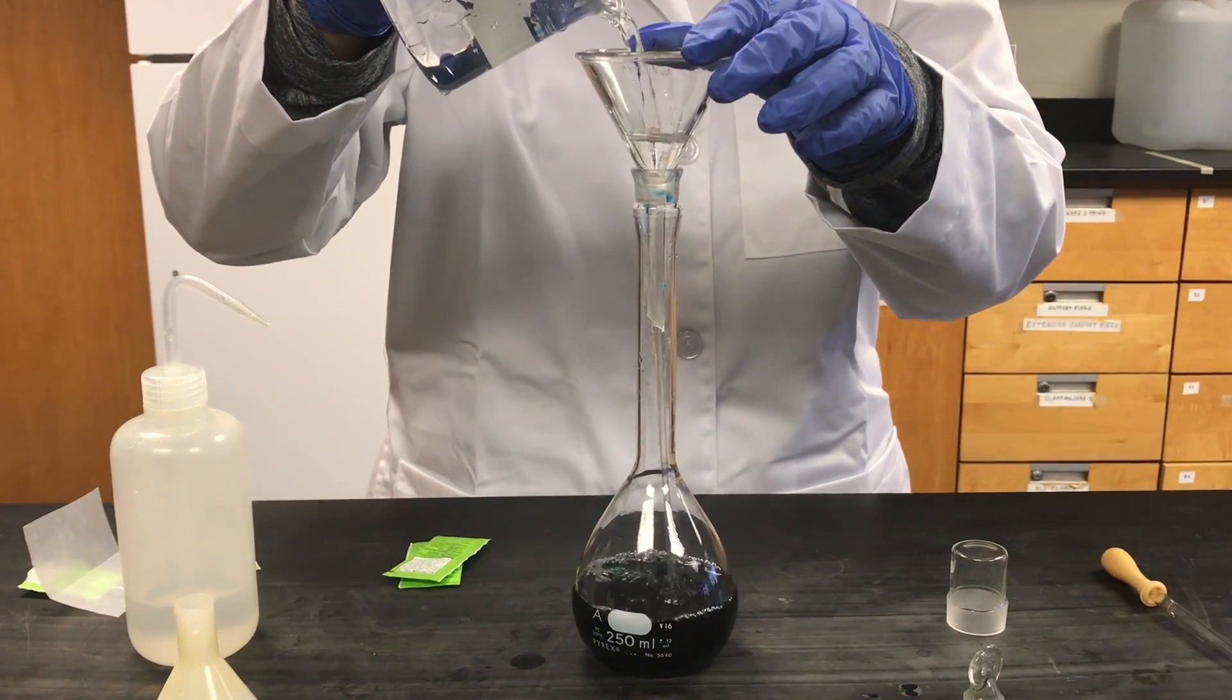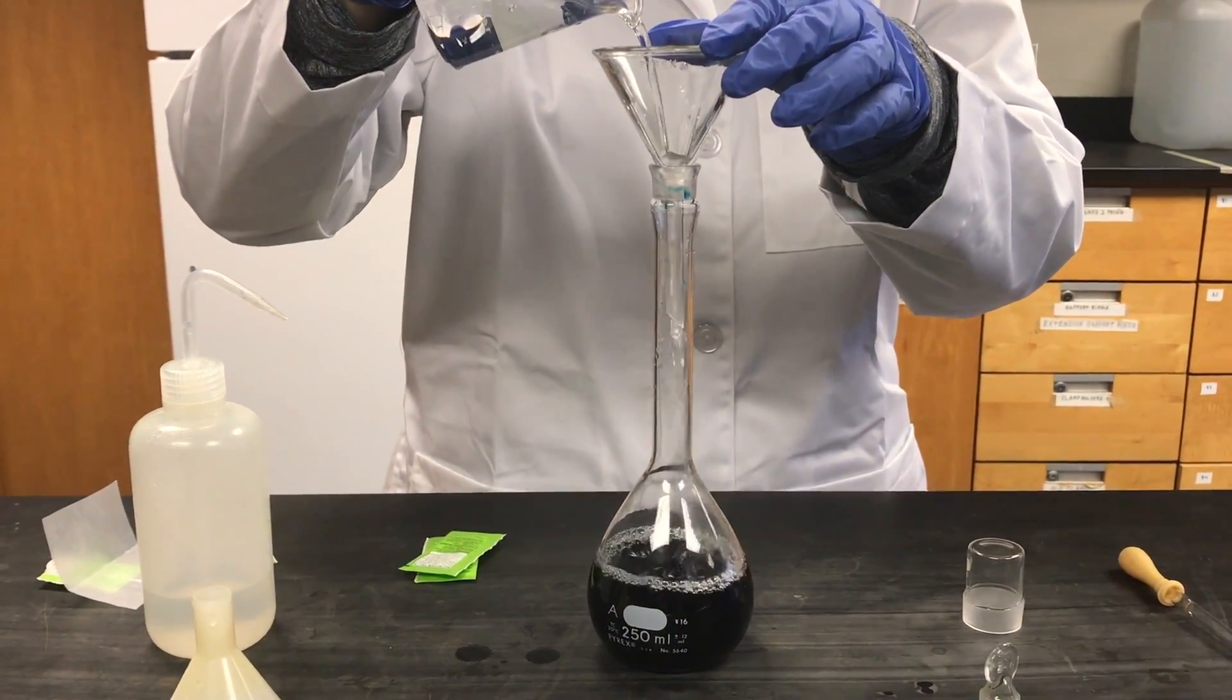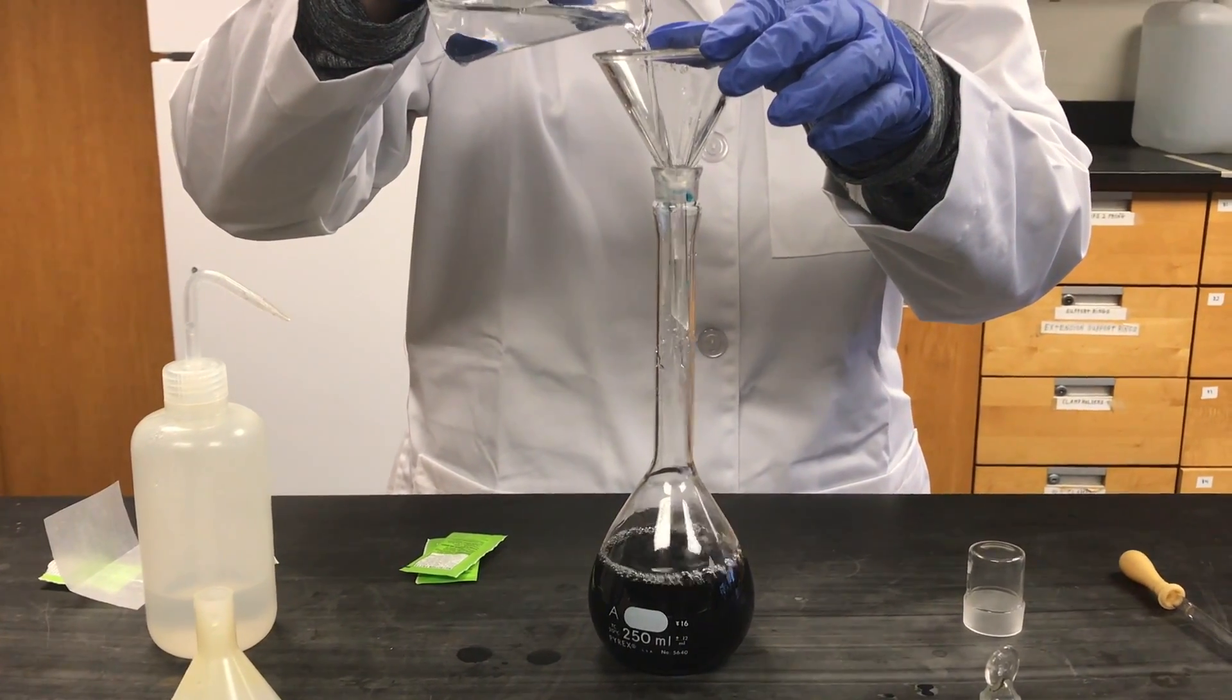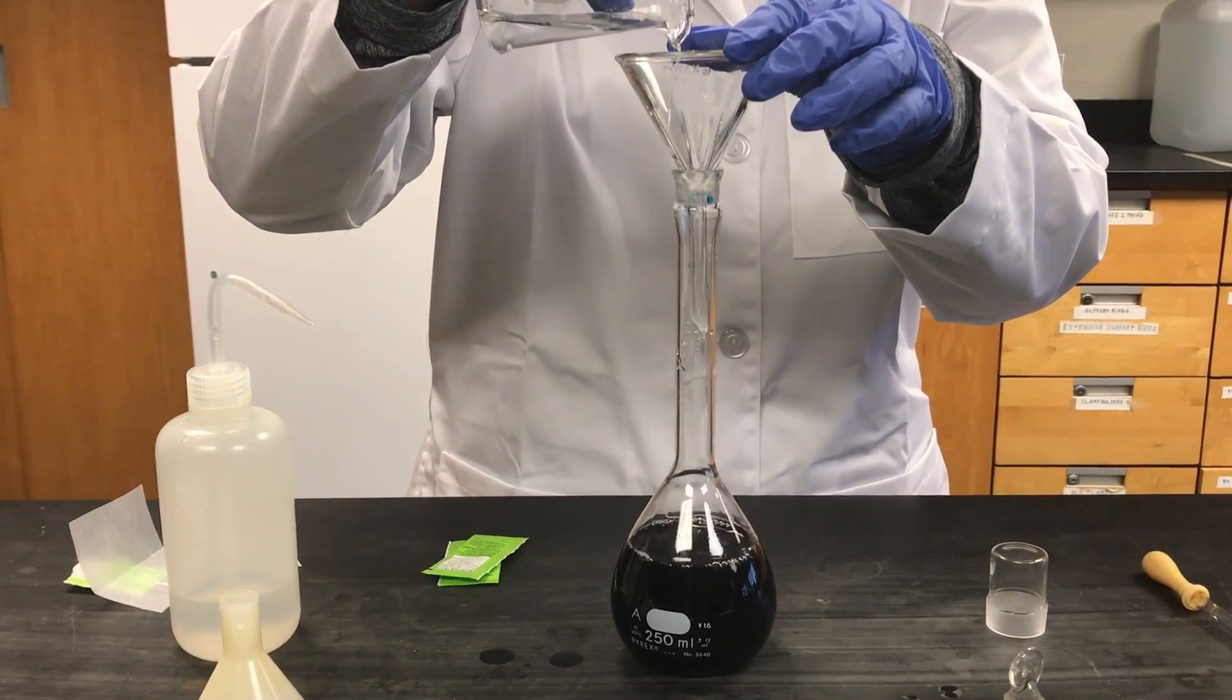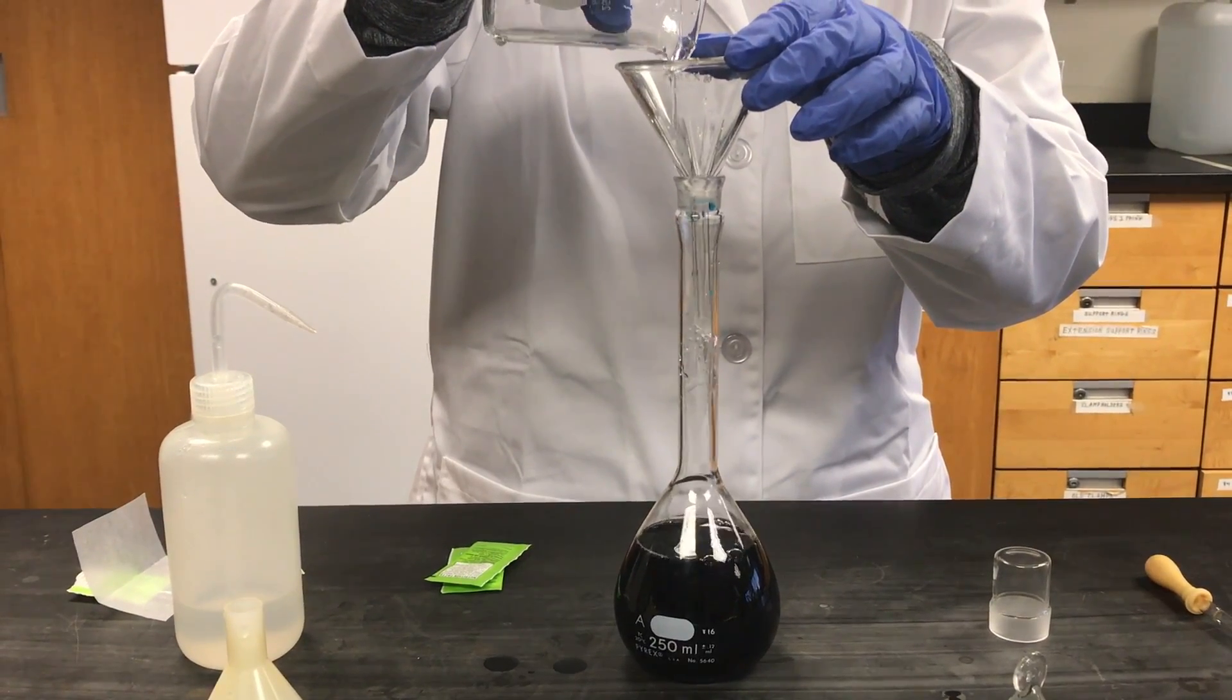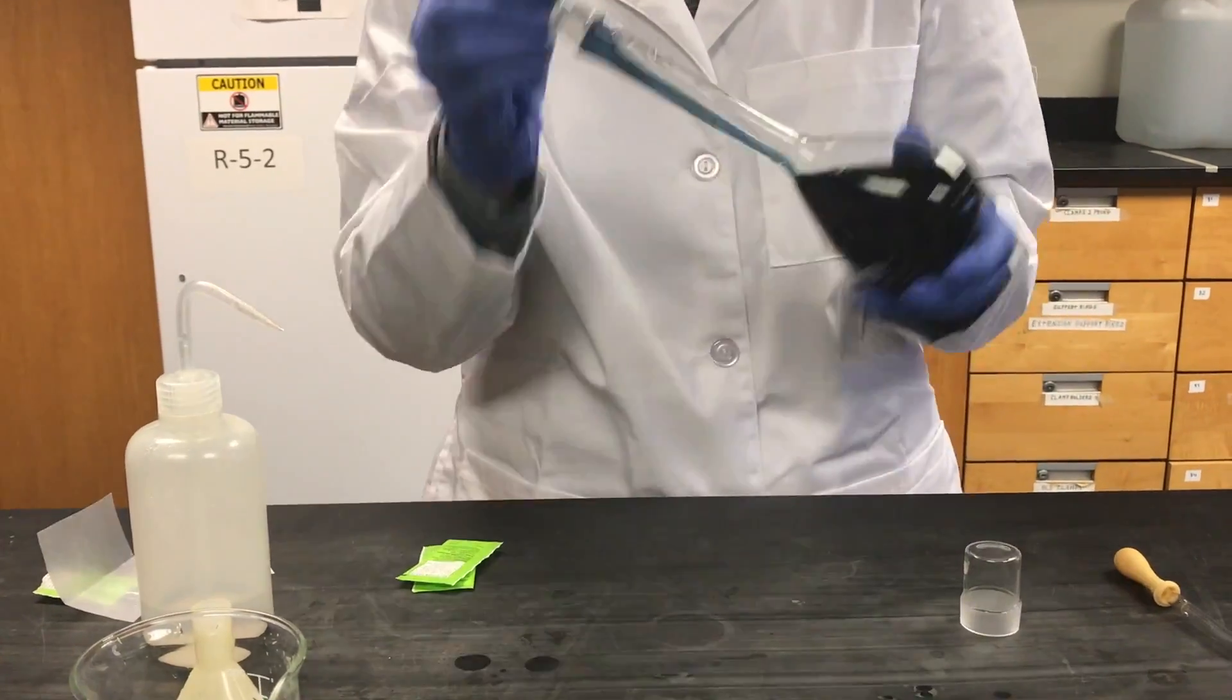Next, fill the volumetric flask up 75% of the way. And mix 20 to 25 times again.